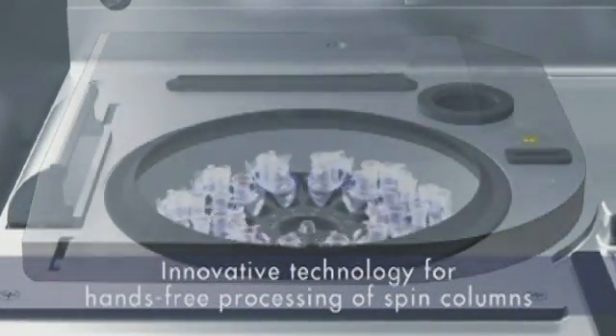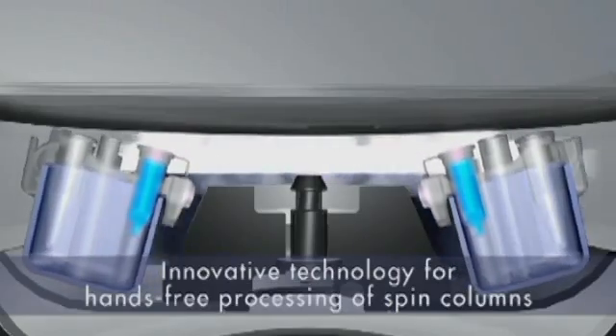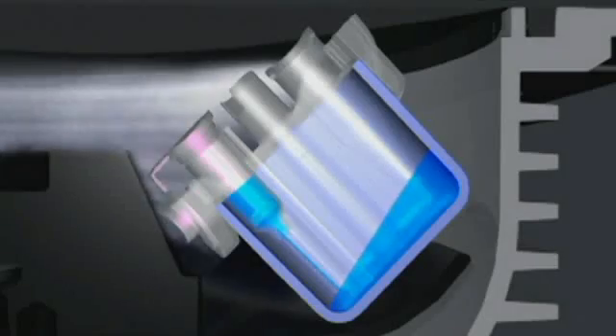Walk-away spin column processing frees up your valuable time and lets you focus on other tasks in your lab.